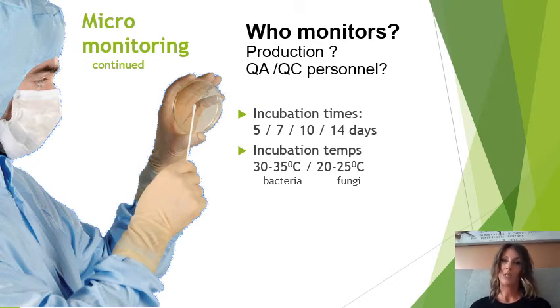That is because our plates firstly are prone to desiccation, so they will dry out as you incubate them. The longer you incubate them, the thinner they become, where the moisture is being drawn out, and the less likely bacteria can proliferate on them. So we do limit the number of days that we incubate. Our broths we leave to incubate for a bit longer. This is because sometimes organisms can be slow growing in broth, and it's just because of the moisture content, broths can tolerate longer incubation times.